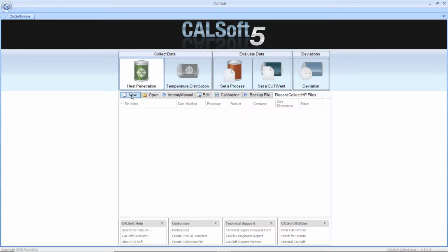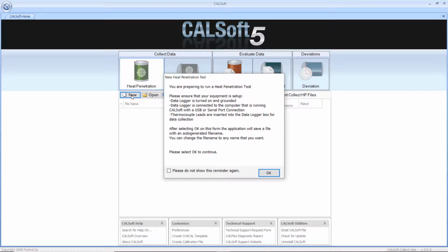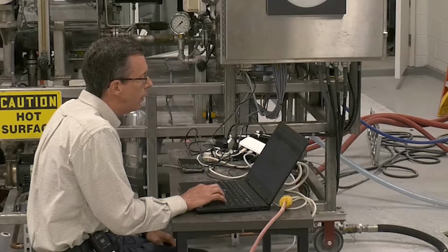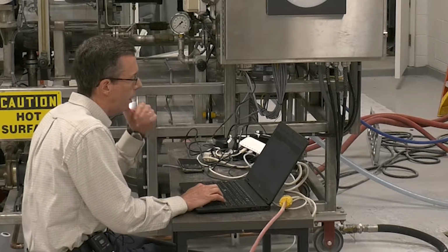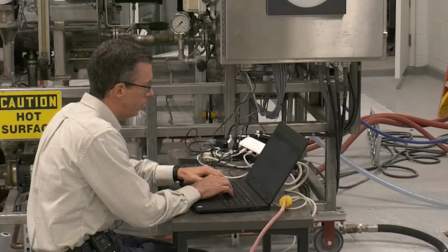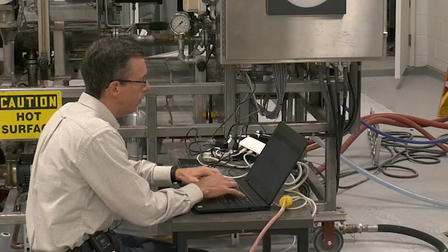Let me sit down, it's easier. Well, I'll leave that for now, just close that. Then it has the date with a 01 at the end, so it's going to be 2019, October 10th, 01. I usually leave the 01 because I'm typically doing a replicate. Then I'll put test at the end so you know.